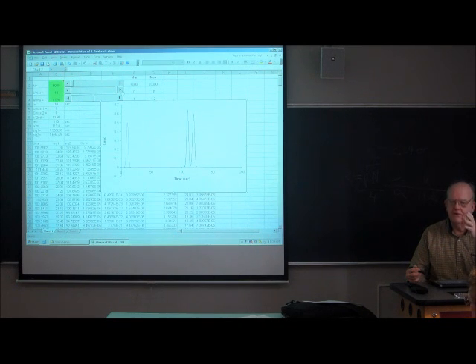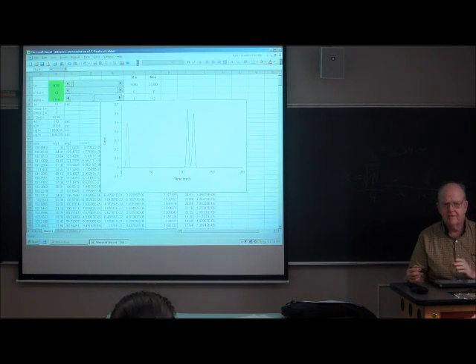The absolute retention is one of the easiest things to change in chromatography. So, again, the first law of chromatography is if you don't have retention, you can't get resolution.